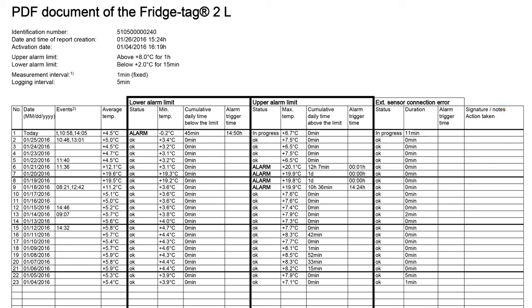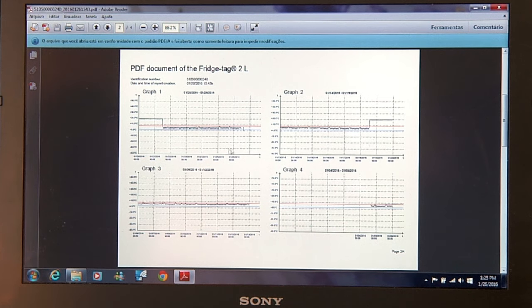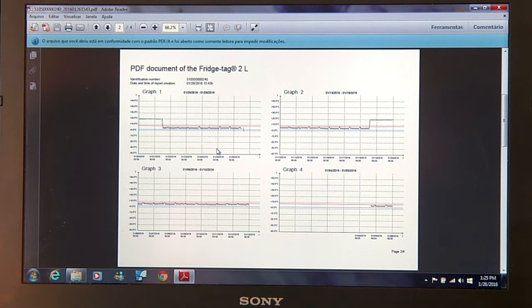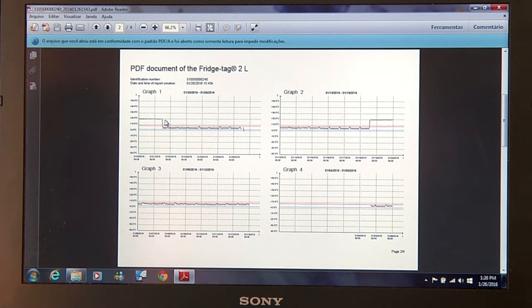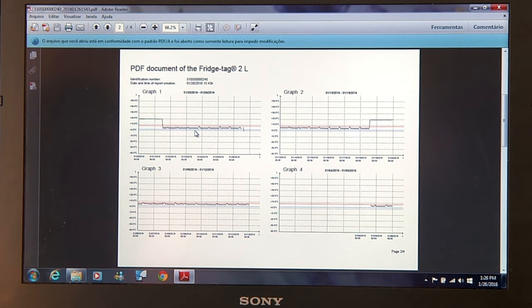With the Fridgetag 2L, you have a second set of data in the PDF. You'll see weekly graphs of all the information. And you can see in this past week that there were some high temperatures. This is useful if you're trying to root cause some alarms that are occurring.